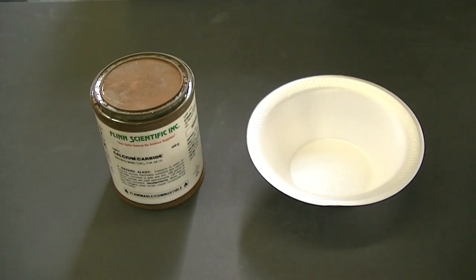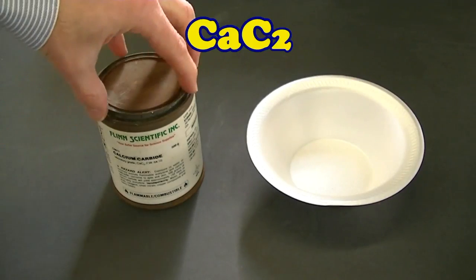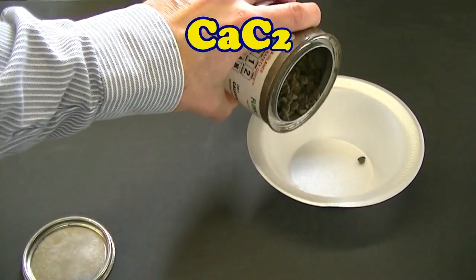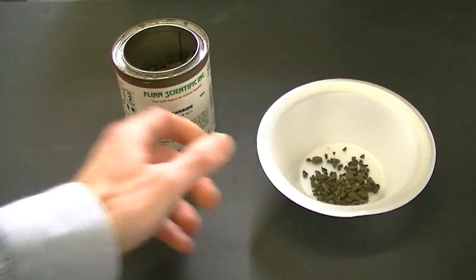Calcium carbide is a very interesting compound. Its chemical formula is CaC2. You can see that calcium carbide is a hard and dark gray-brown material.